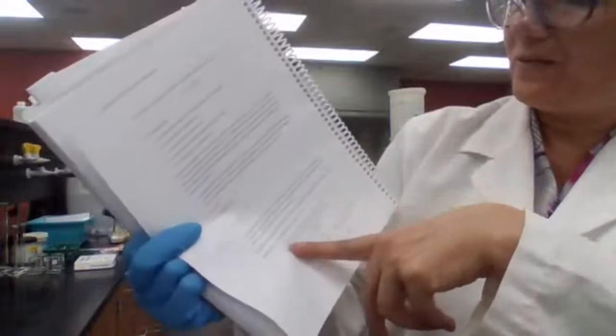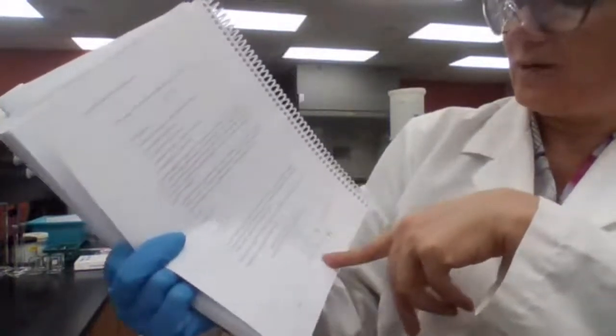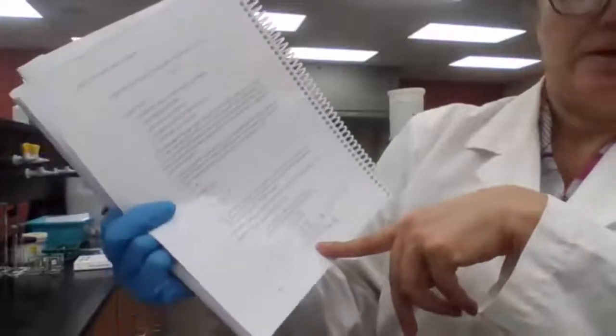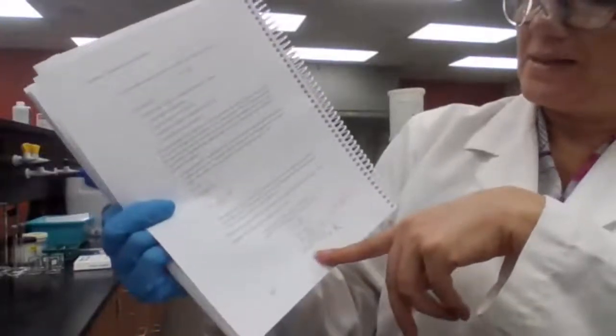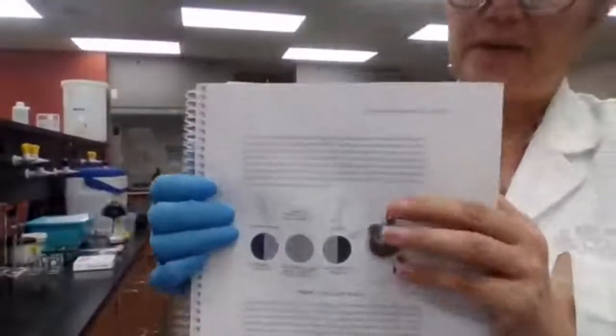And from the enantiomeric excess, I can calculate the percentage of R and the percentage of S. And at that point, we can see how efficient our separation technique was.